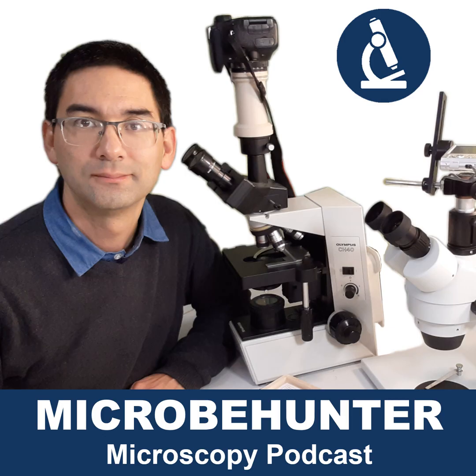Well, one reason why some features are not visible with a light microscope is because those features are simply too small to be seen using a light microscope. There is a so-called resolution limit. And this means that depending on the objective that you use and also on the wavelength of the light, there is a limit of what can be resolved. And there are certain details that are simply too small.